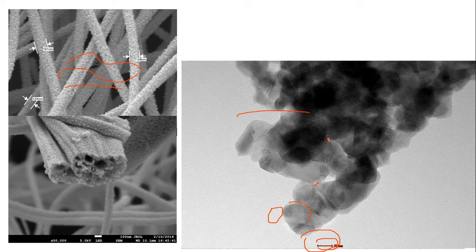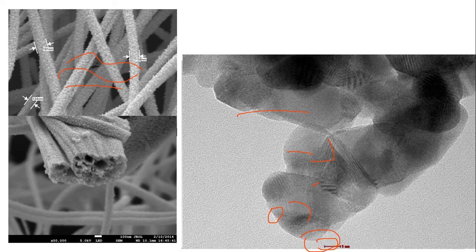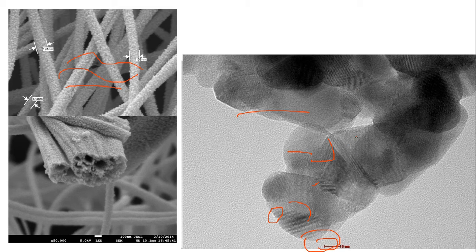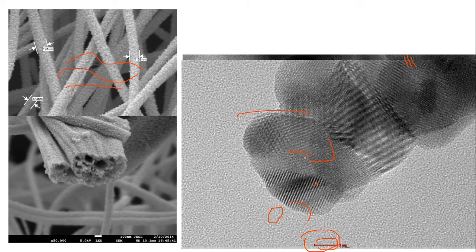These are the grains. You can see here, and these are the grain boundaries. Let's further zoom it. Now you see, now this is high-resolution images, so the planes now are getting clear. These are the lattice planes. Further zooming.